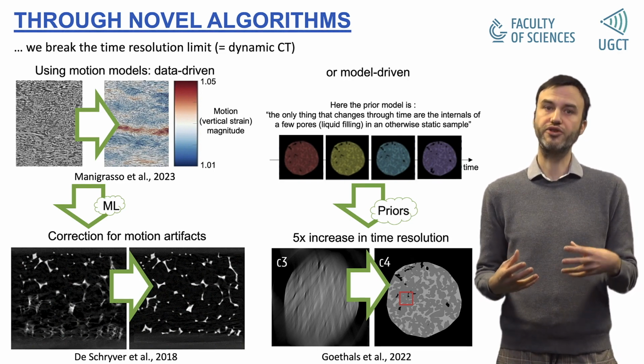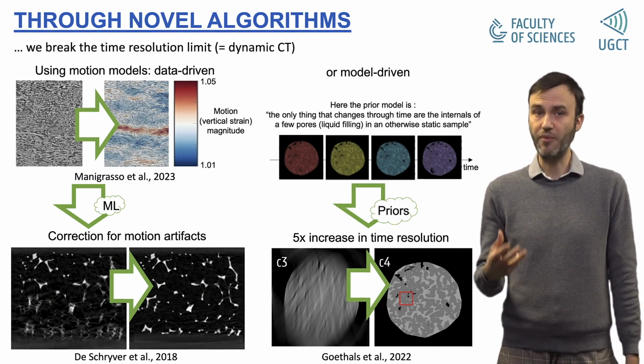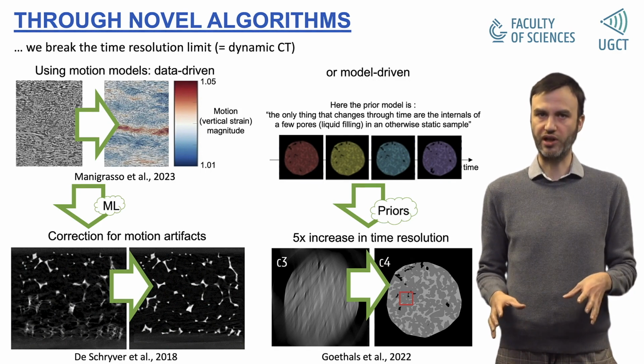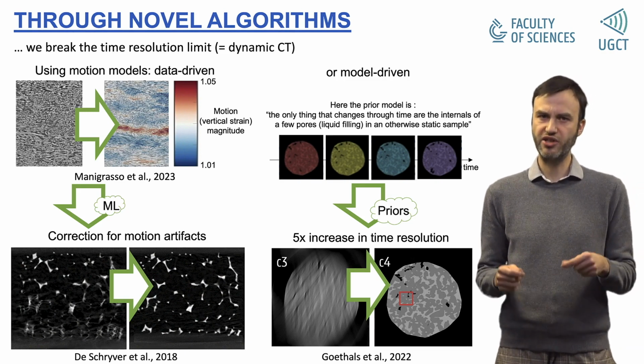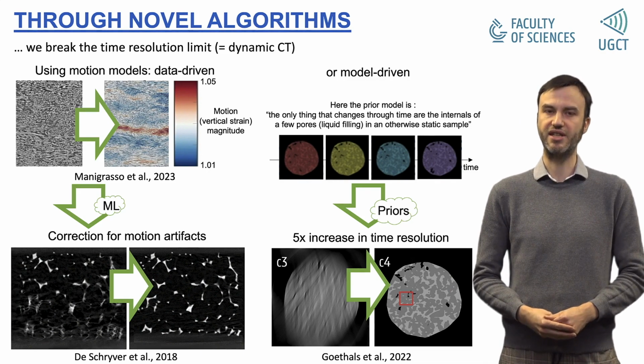Together, such methods offer an exciting way to mitigate motion artifacts and thus increase the time resolution in dynamic CT. As such, work like that of our researchers, like Dr. Wannes Goethals, is enabling us to create true videos of the dynamics that is going on inside our CT scanners.